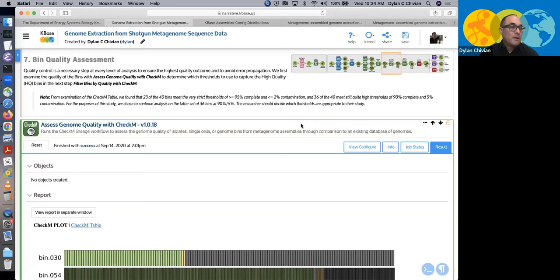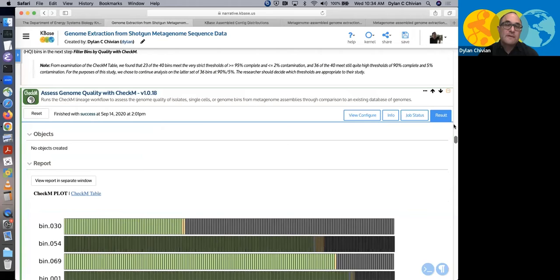So for example, maybe you are talking about Desulfovibrio, and if you place a bin in Desulfovibrio, you know that all of the sulfate reducing machinery also is going to be present. Maybe not a single copy, but there will be collections of genes that are essential for that lineage to function. And so you can expand the single copy markers into lineage specific or clade specific marker sets.